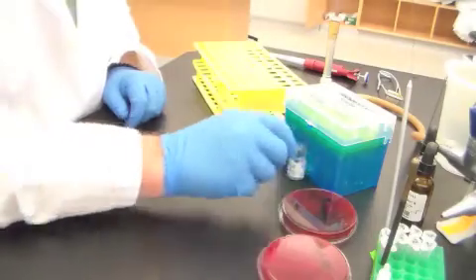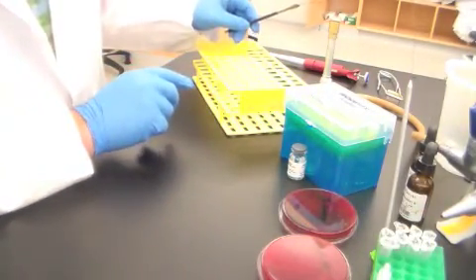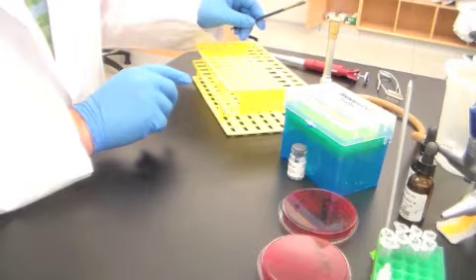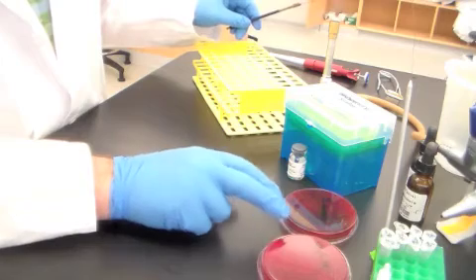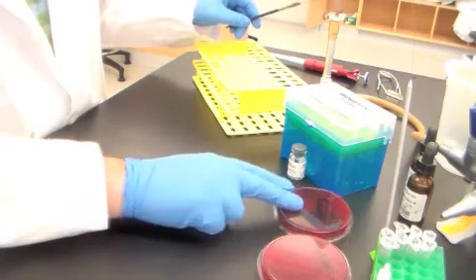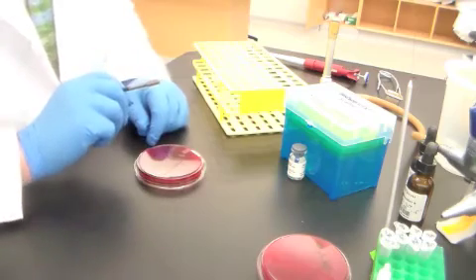What we'll do next is to use a sterile loop. I have the flame going. I think it's outside of the picture. I'm going to sterilize this loop, and I'm only going to do one species right now to save on resources, and this is just for illustration.